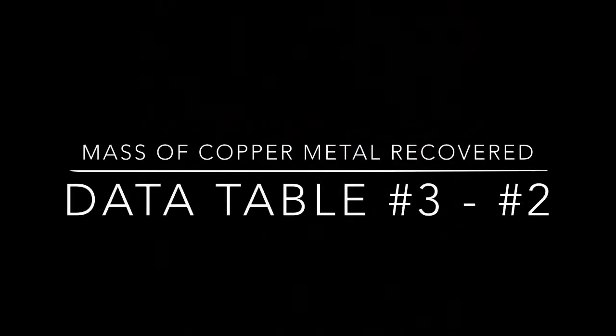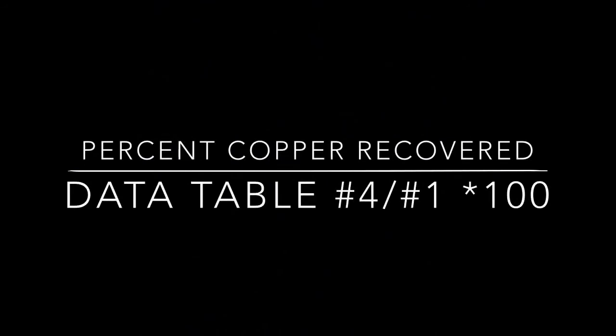To find the mass of the copper metal recovered, we're going to take the mass of the bottle or dish and copper metal recovered, data table number 3, and we're going to subtract the mass of the sample bottle or weighing dish, data table number 2. To find the % copper recovered, we're going to take data table number 4, the mass of the copper metal recovered, and we're going to divide it by the mass of the original copper sample, data table number 1. Don't forget that when you convert to a percentage, you multiply by 100.